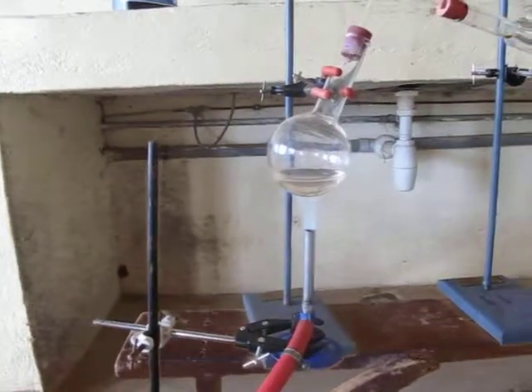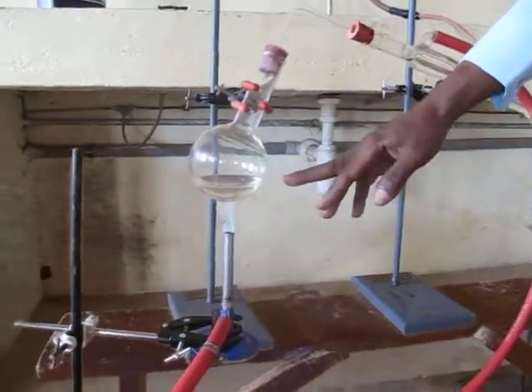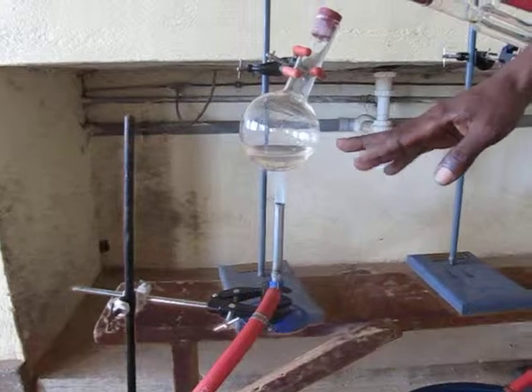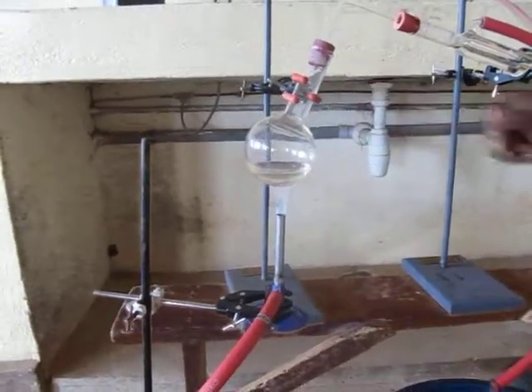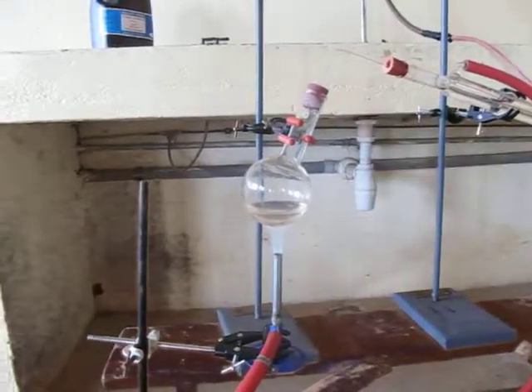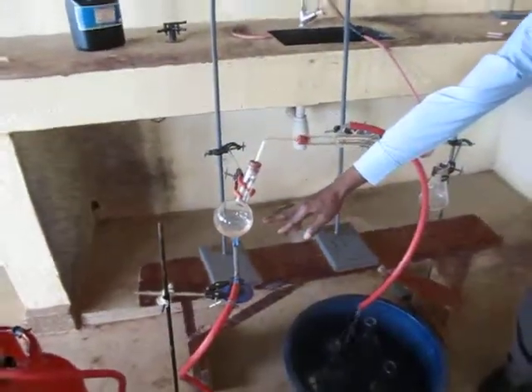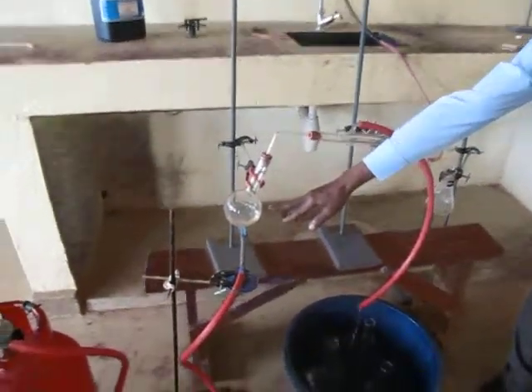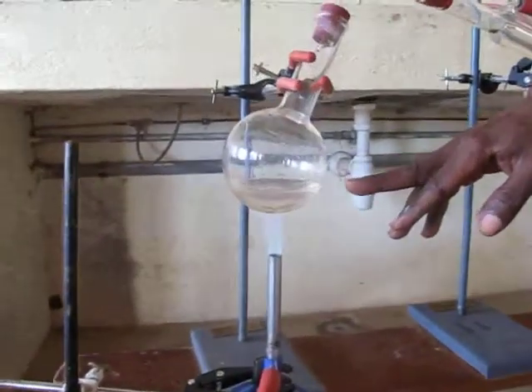We shall discuss later on, but I want you to know that water and ethanol boil at different temperatures. One of them will boil fast. The one with the lowest boiling point, that is the one which will boil fast. And you can see it's already boiling. The boiling of the first fraction has already started.